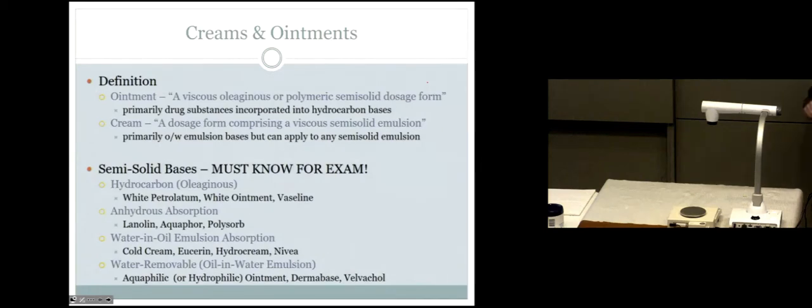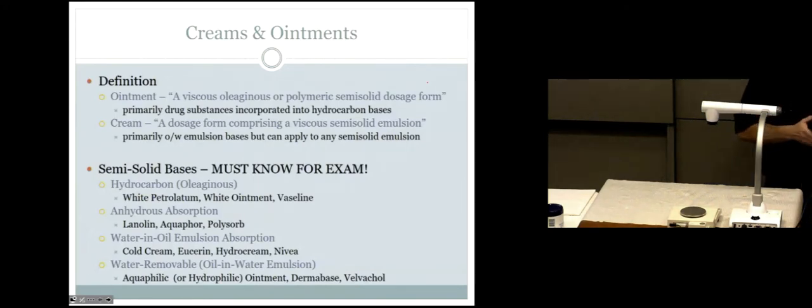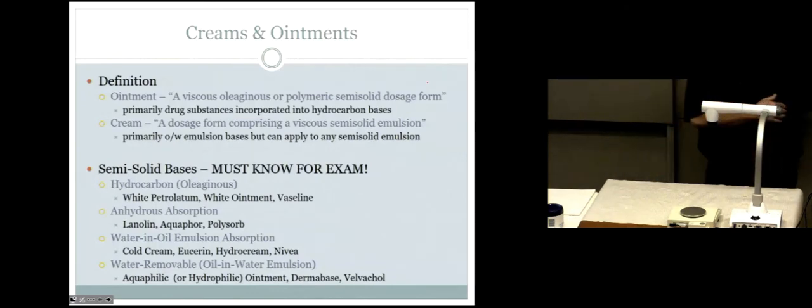It is greasy, occlusive. Does everyone know what occlusive means? I'll give an example of that here in a minute. Occlusive, all right? Separate that from a cream. Most importantly, what color are creams? They are not yellowish. They are white. They are soft. They rub into the skin. They kind of disappear. They're not occlusive. They don't cover the skin because they rub into the skin, okay? They're water washable, whereas the ointments are not.